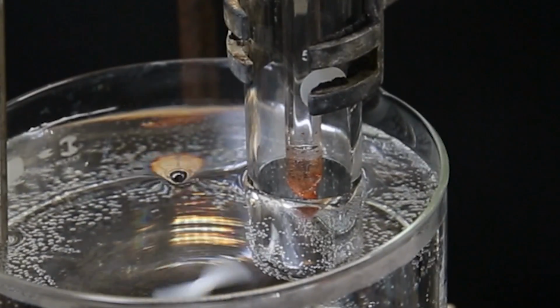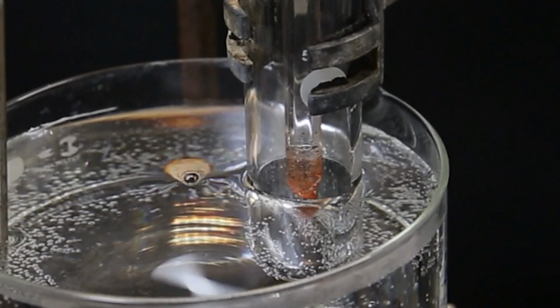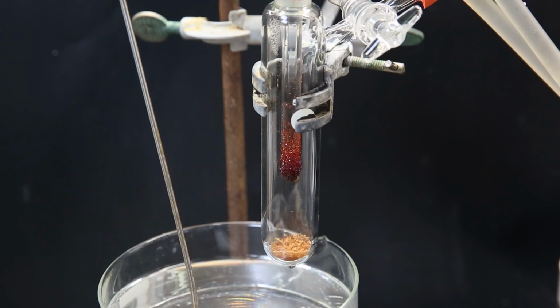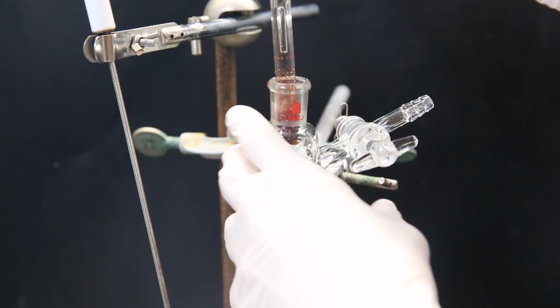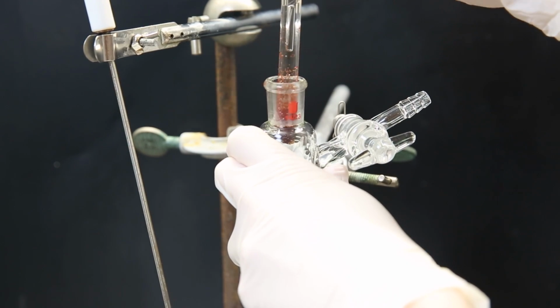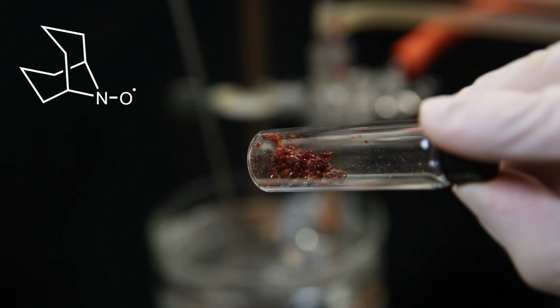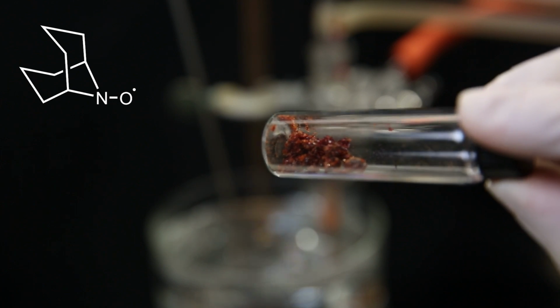We slowly see the formation of crystal deposits on the cold finger, and after a few hours, it has formed beautiful shiny red crystals. Unfortunately, the layer is too thick to fit through the joint, so the bottom part fell off, but it stayed in one chunk, and I could take it out by grabbing it and making it smaller with some tweezers. I scraped off the rest of the crystals with a spatula, and put them all in a vial. In the meantime, I run the remaining stuff again in the background.